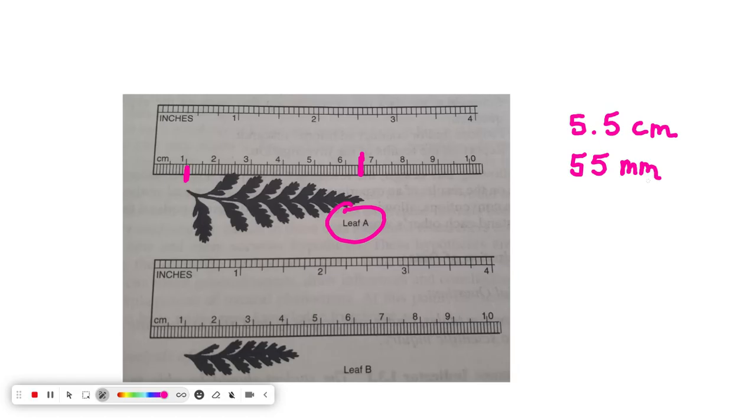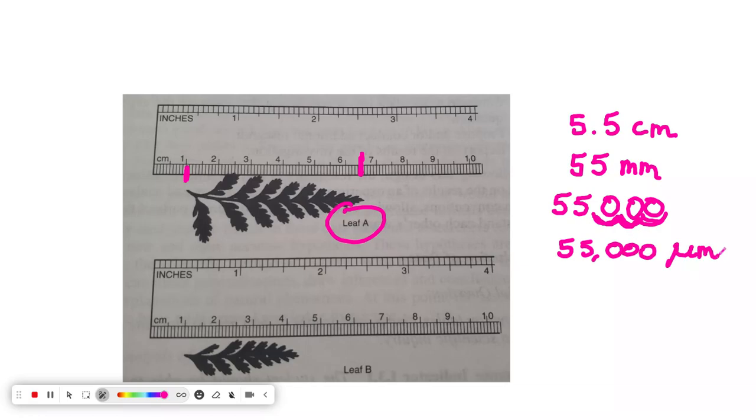And remember, 1 millimeter is 1,000 micrometers. So how many micrometers would that be? With 55, we have to move it 3 times from the decimal. Remember, the decimal is 55.0, right? So we move it 1, 2, 3. Just fill in those zeros. It's 3 because it's 10, 100, 1,000. So 55,000 micrometers is the length of that leaf.